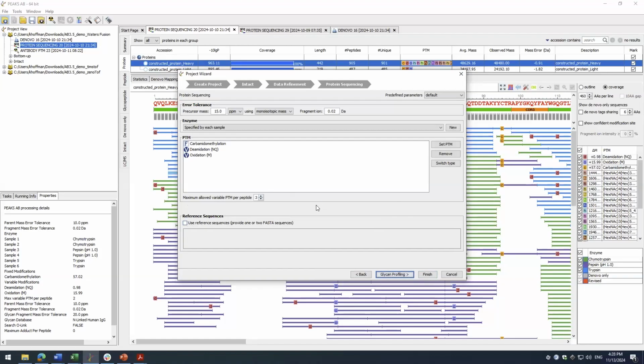We had a question in the earlier session today, so I'll just mention this: PeaksAB has the ability to sequence non-antibody proteins as well. If you have a protein that's different from an antibody and you have some idea of what that protein might be, but you don't know the sequence, you can paste in a reference sequence. PeaksAB will still perform the de novo sequencing and assembly, but it could use the reference sequence to identify more PSMs in order to improve the coverage and the sequencing result.